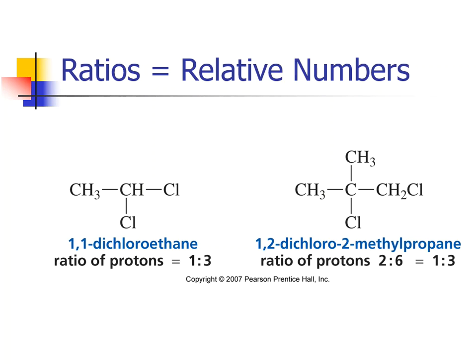This particular molecule to the left looks like it has 1 hydrogen here and 3 hydrogens there. So the ratio is 1 to 3. Okay? On the molecule to the right-hand side, this molecule is clearly different. This CH3 group and that CH3 group, these are equivalent signals. So therefore, this is 6 hydrogens in total.